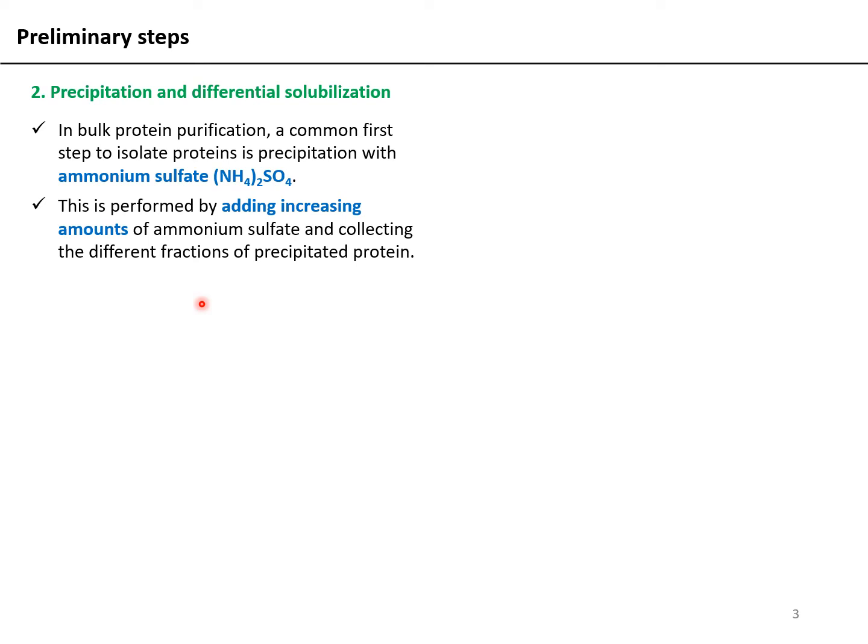Now, how does this work? What is the mechanism behind this? Or how does the addition of ammonium sulfate promote precipitation? We will discuss that.